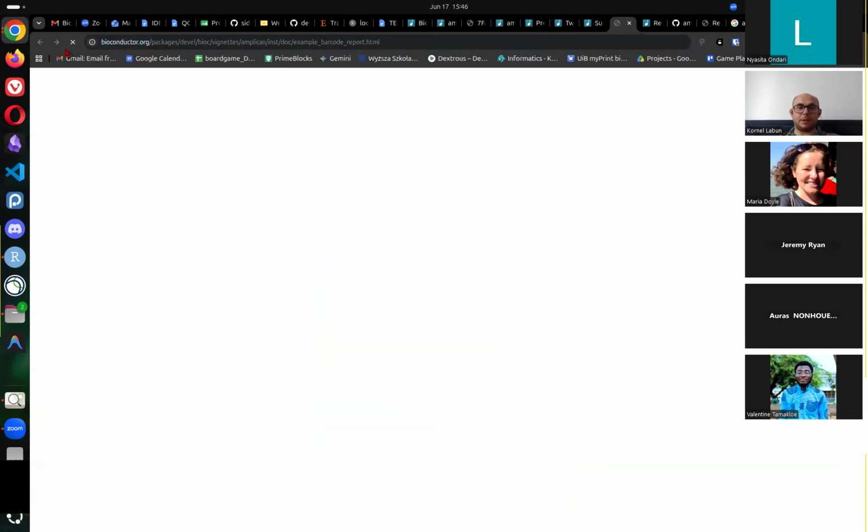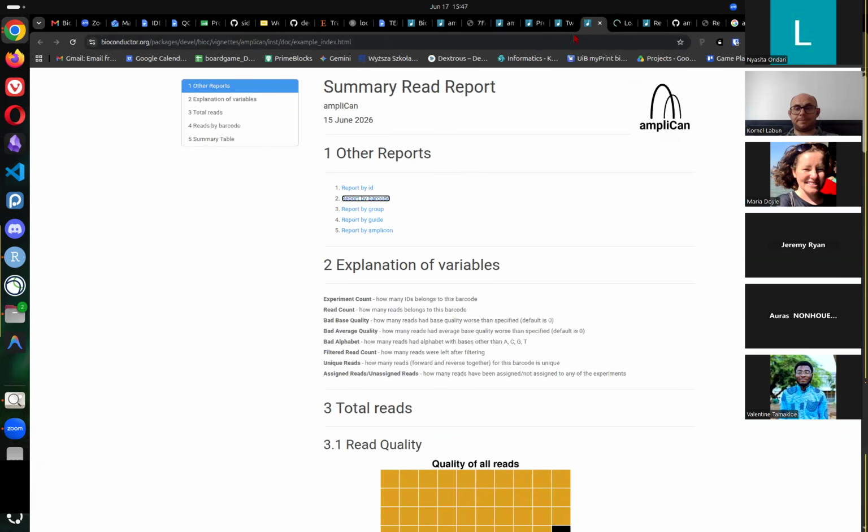very slow internet because it's not nice. They were split basically, and also you can see where at the highest, maybe when it loads in a second. I wonder what is the problem here.